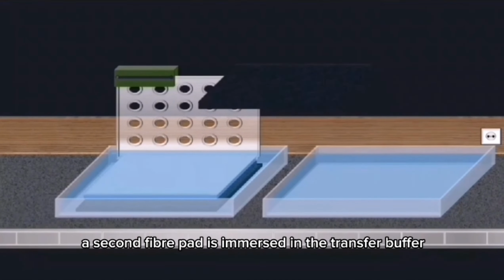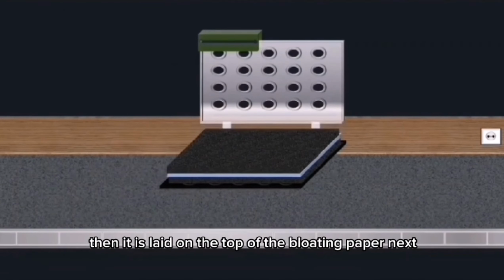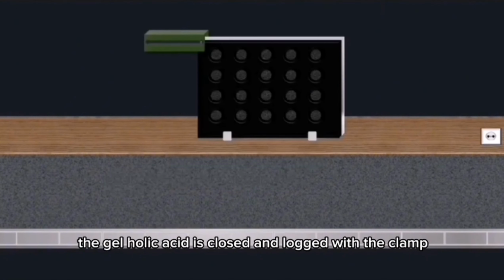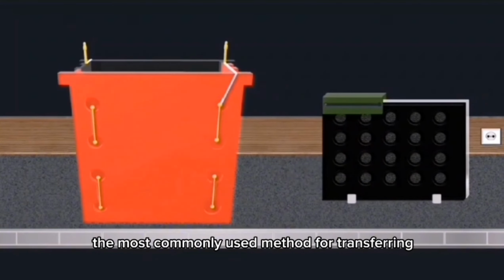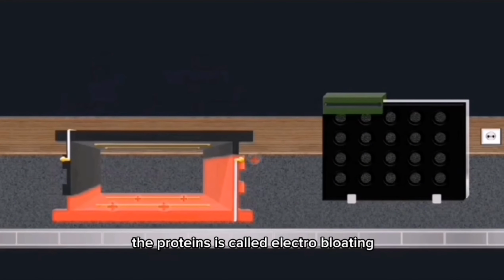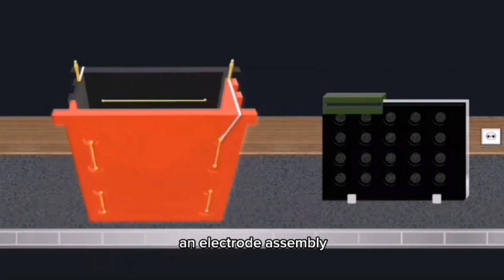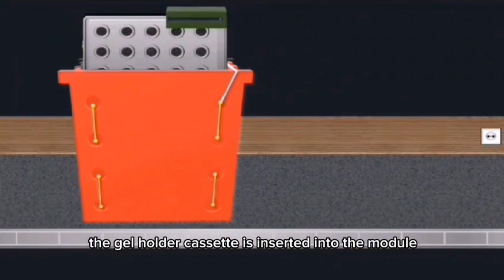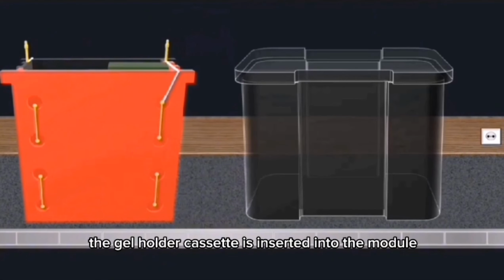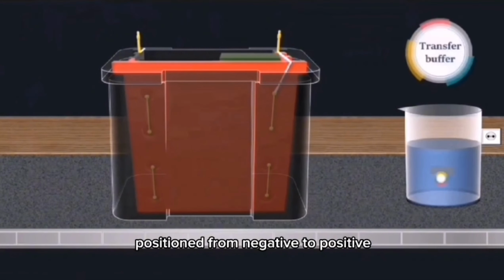Finally, a second fiber pad is immersed in the transfer buffer. Then it is laid on the top of the blotting paper. Next, the gel holder cassette is closed and locked with a clamp. The most commonly used method for transferring the proteins is called electroblotting. During this transfer, an electrode assembly with positive and negative electrodes is used. The gel holder cassette is inserted into the module, ensuring that the cassette is properly positioned from negative to positive.